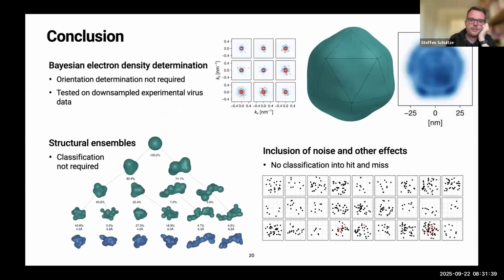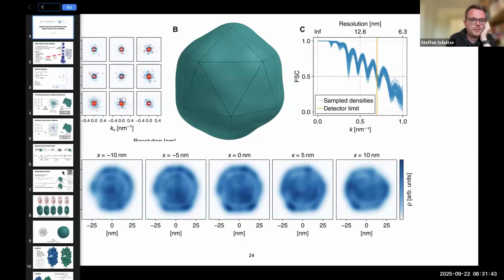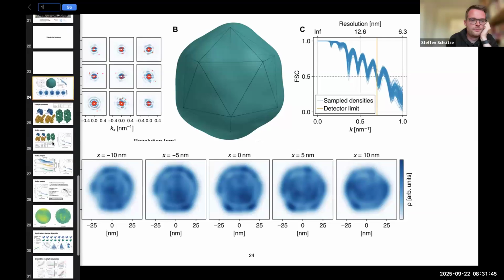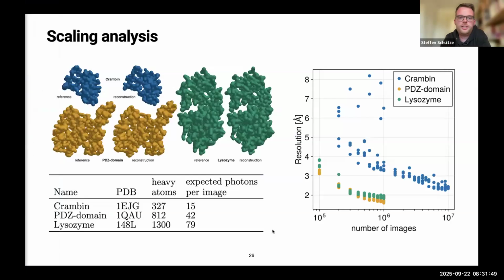So I have done some tests on different sizes. Hang on. Yeah, so here, this is the noise-free case, but I have 3 separate proteins. The largest one is the lysozyme we have seen. And you can see crambin, this is 46 residues, whereas this is a few hundred.